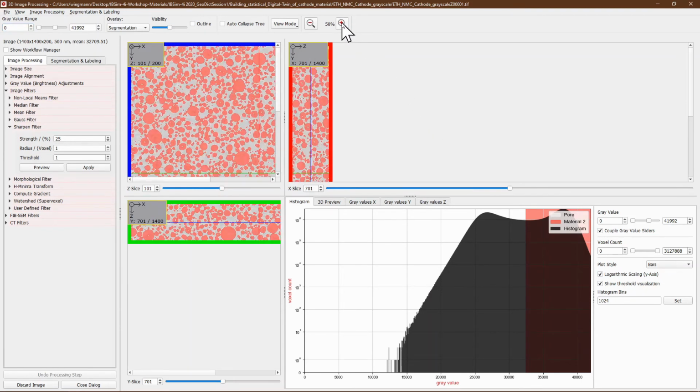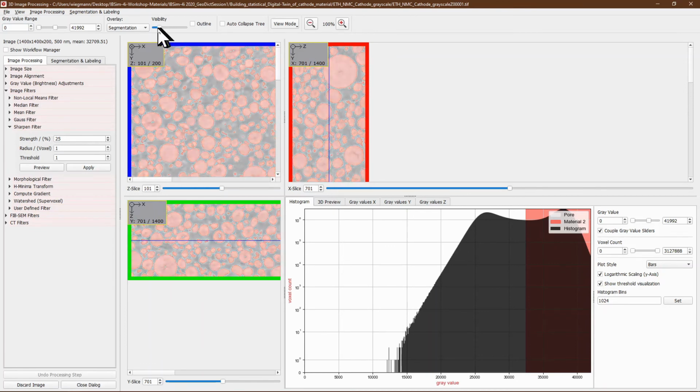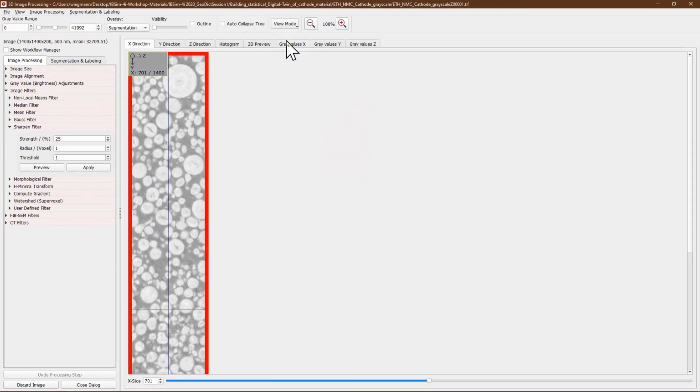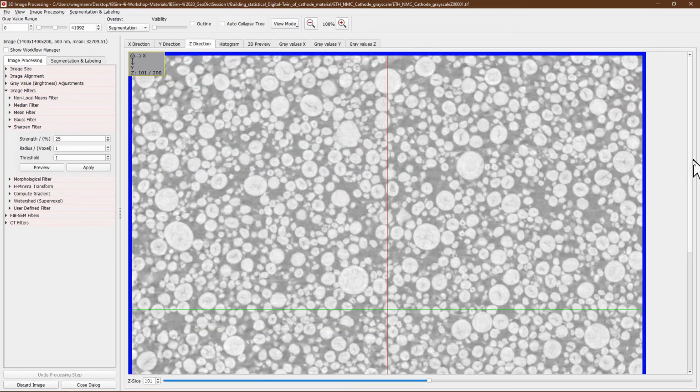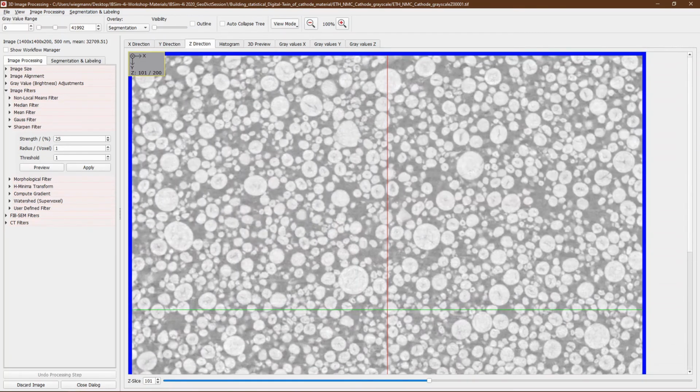So I actually go to the full size of the images, and I will switch off the segmentation again, and for example I might want to see the XY view alone and complete, and I should go to the Z direction in here, and then we can see that this is now the original size of the data set that one can run analysis on, of course, as well, but everything would take significantly longer, hours instead of minutes in this case.